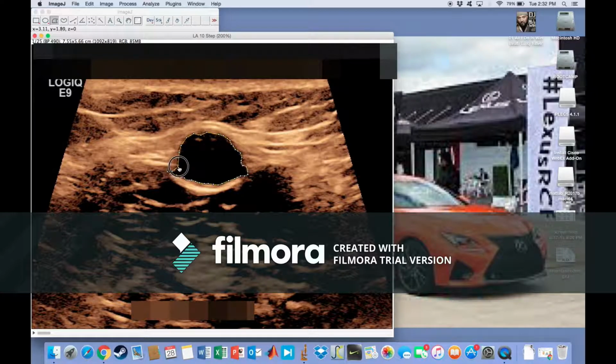And then this is kind of a hard image to tell, and it's probably not a great one to be showing on the video, but there's a lot of white noise, which is what the ultrasound is called when there's a bunch of static in the photo.